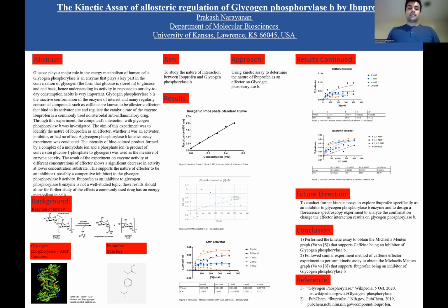Using molybdate, which when combined to inorganic phosphate forms a blue-colored reaction mixture, we can find the extent or the amount of product formed, thus the enzyme activity, by monitoring the intensity of the blue color.